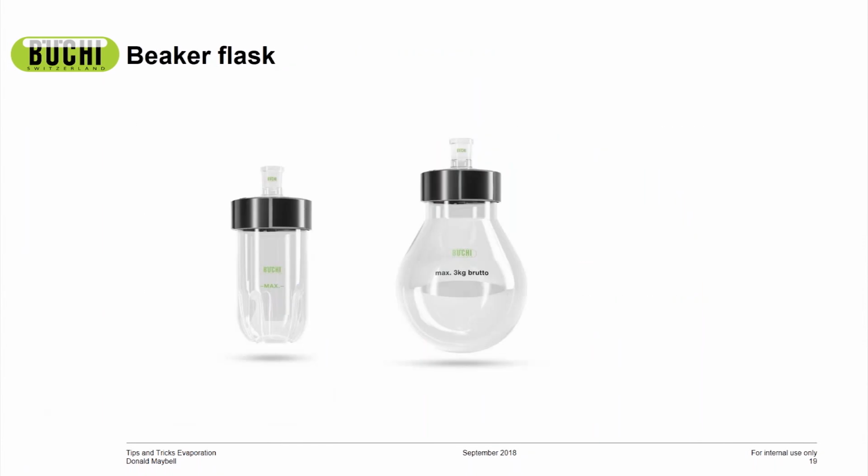And then I just want to touch on the beaker flask. The beaker flask actually has a top on it that allows you to stick your whole hand in there. I'm not sure if anybody else has tried, but trying to scoop your product out of a 24/40 joint is just not that ideal. It can be quite a hassle, especially if you're working with something sticky, or even powder sometimes, depending on how fine it is, when you're trying to scoop it out and it ends up blowing all over the place. With this, you just take off the top, stick your hand in there and scoop everything out, or you could even pour it out depending on what you're working with.